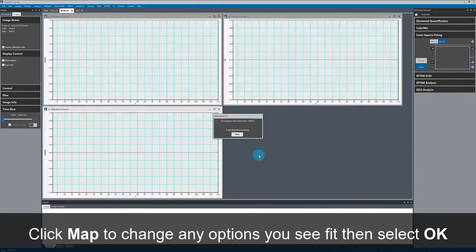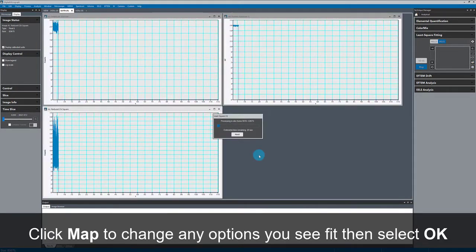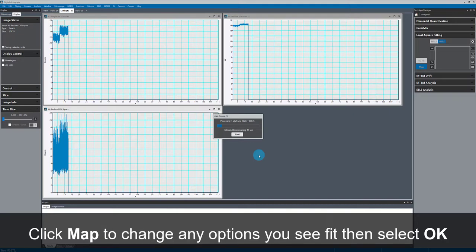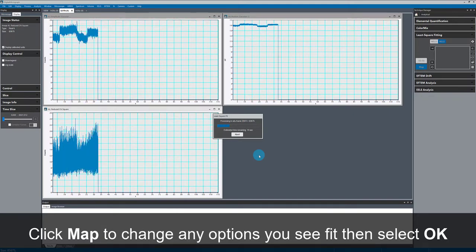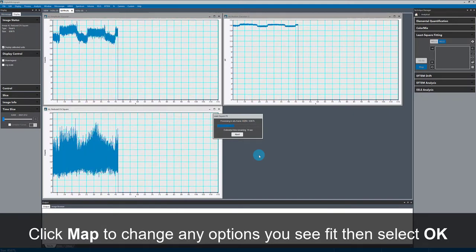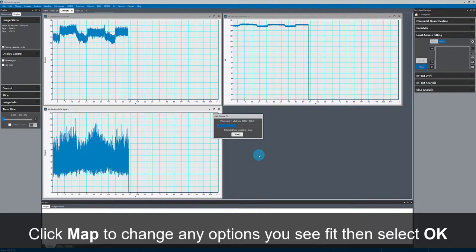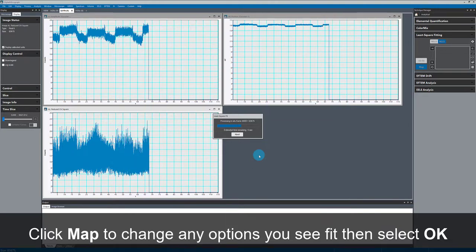So now it's going through and processing every one of the 83,000 plus spectra in this dataset, which takes just a few seconds.